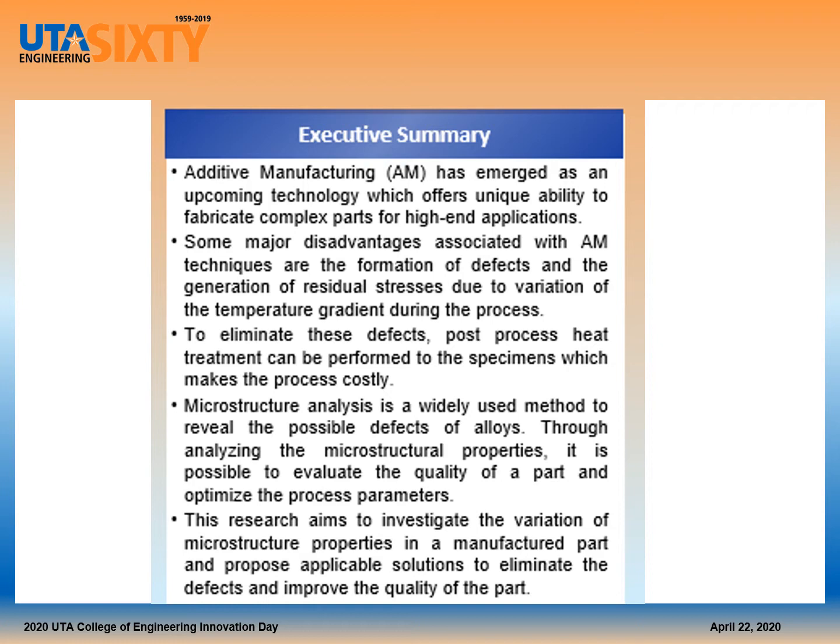Microstructure analysis is a widely used method to review the possible defects of alloys. Through analyzing the microstructural properties, it is possible to evaluate the quality of a part and optimize the process parameters. The objective of this research is to investigate the variation of the microstructural properties in a manufactured part and propose applicable solutions to eliminate the defects and improve the quality of the part.